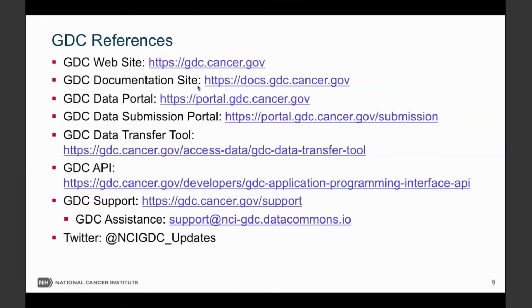Yeah, just wanted to give these different resources for the GDC. Colin's shown you many of these, but please feel free to take a look at the data portal. You don't need a login, as Colin showed, so you can do any of those things that Colin demonstrated without any login whatsoever. That's really only needed for the raw BAM files and some of the variant data.